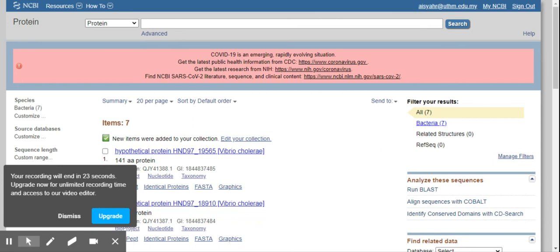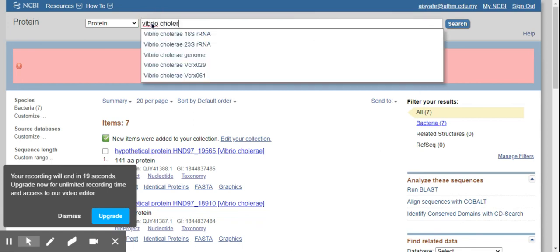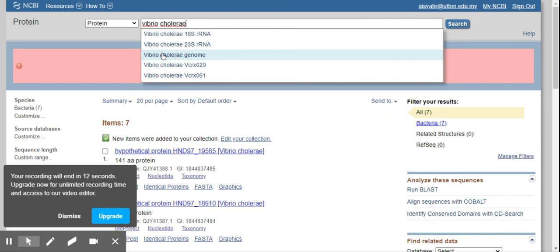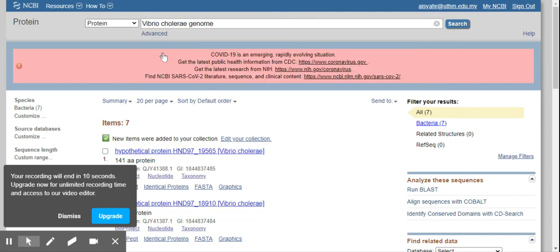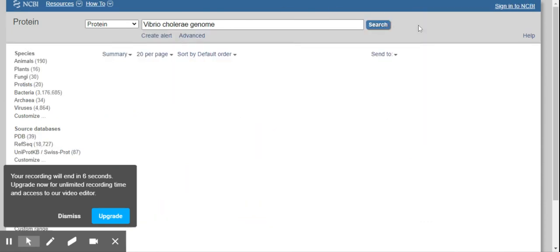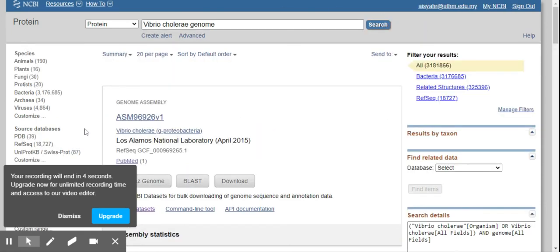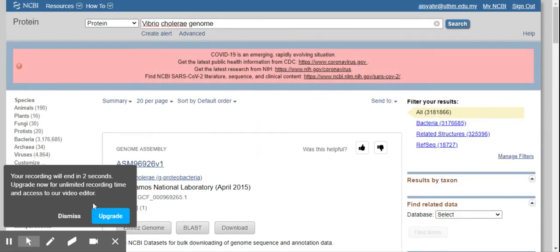Another way is to write in Vibrio cholera here. Okay, so there are many different choices. So you can just click on one, all right, and then it will give you all the protein.